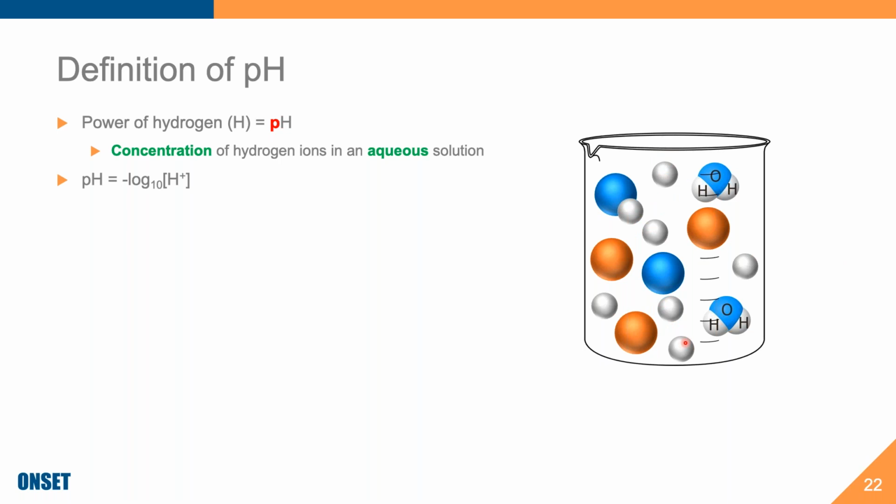And to calculate this, one classic algorithm for what pH is, and this is the most simplified version that you'll have, is that pH is the negative log of the hydrogen ion concentration. Really quickly, classically speaking, the negative log of the hydrogen ion concentration was actually meant to be the negative log of the hydrogen ion's activity. And as it turns out, the activity is equivalent to the concentration for hydrogen. So modern ways of discussing it are to say negative log of the hydrogen ion concentration.